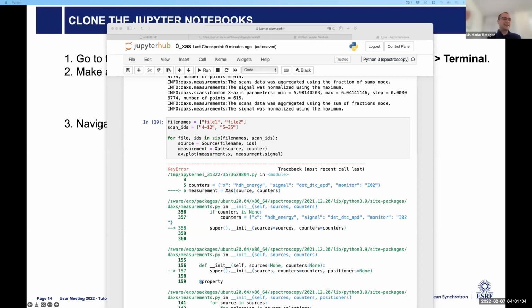Okay. I think here, going forward, it's going to be like when you're on a beamline, the local contact is going to provide help to get you started. Depending on the beamline, I do not know on what beamline you measure. So measure 9026. Okay, so then the local contact, when you do the next experiment, will, I think, help you with setting up this type of analysis.